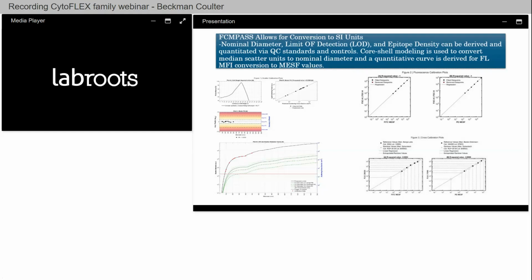This is twofold, something that I have really relied on to understand the performance of my instrument, to be able to calibrate correctly, and to be able to compare results over these longitudinal type studies, or when we're working with another institution to really get a project together. So you can find where things may have gone wrong and really talk to your engineer, and it gives them some idea of where things may have gone wrong. And so it's a freeware. I suggest using something like this.